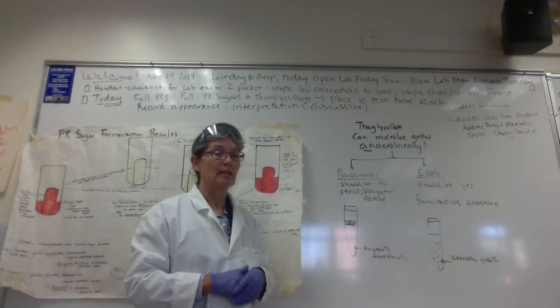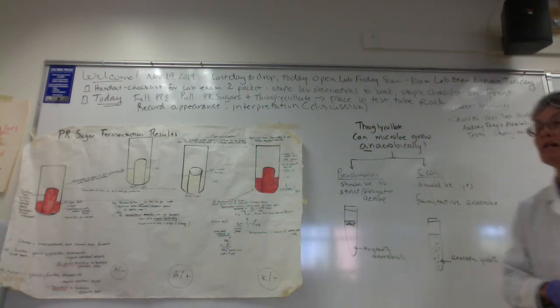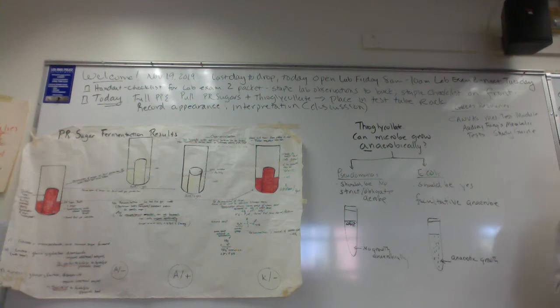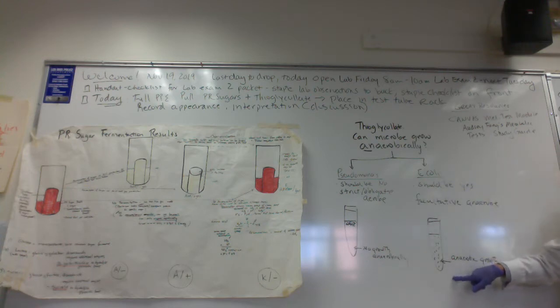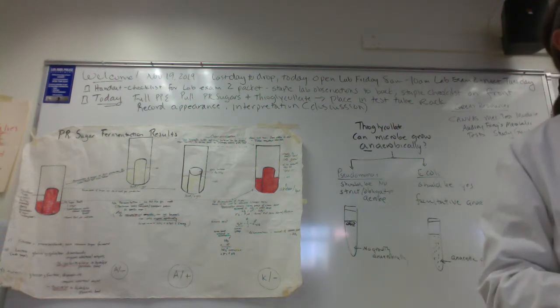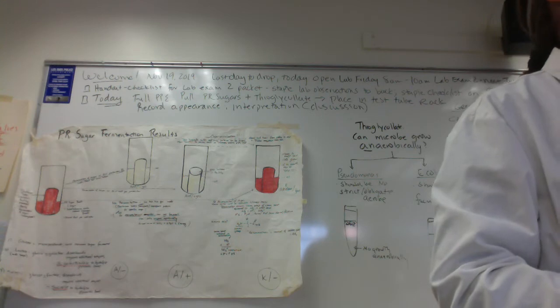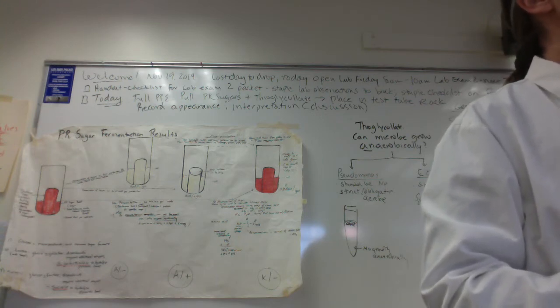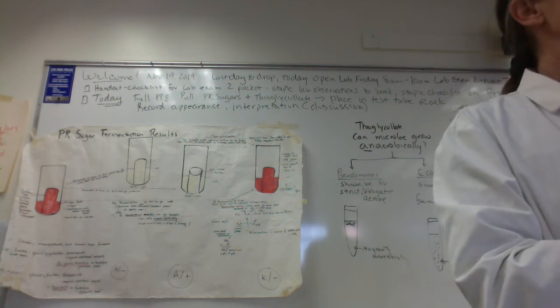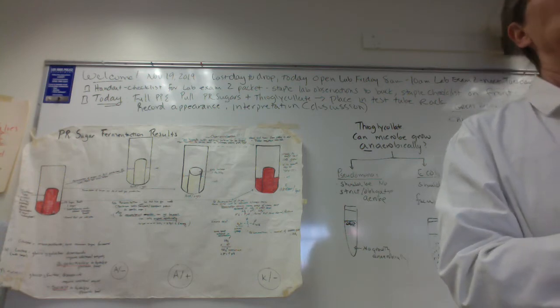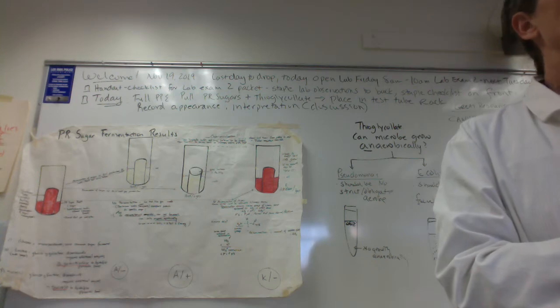In contrast, let's take a look at E. coli. E. coli is a facultative anaerobe — if oxygen is present it can grow aerobically, but if there's no O2 it can switch to anaerobic metabolism, either fermentation or anaerobic respiration. Would you predict you should see cells in the anaerobic portion? Yes. And the E. coli did read the lab manual — there is good growth in the anaerobic butt. So, can E. coli grow anaerobically? Yes, it can.